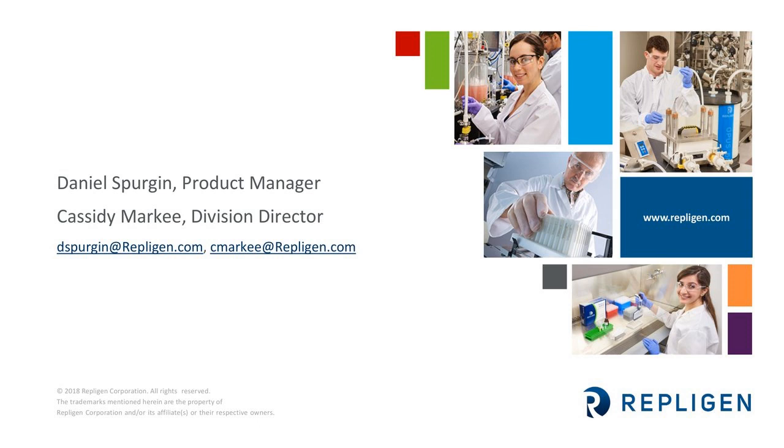Instead, it's better to encase that into a membrane that remains static, if you will, and then you actually pump the buffer on the outside of this encased sample to remove the solutes as they pass across the membrane. So the sample remains protected while the buffer is actually flowing and removing the impurities. This simply can't be done by filtration, or if it can, then it's not very efficient and can result in low recovery.